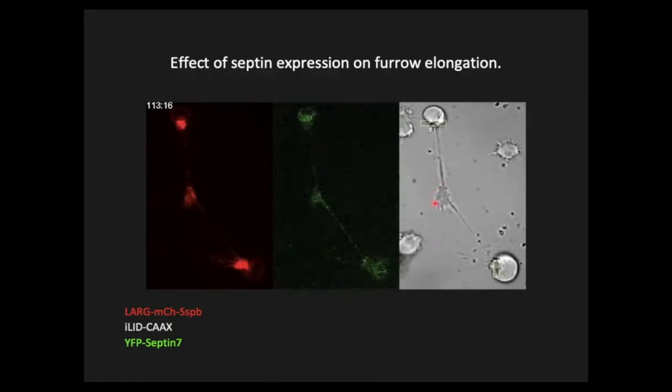You will see, after a while, it seems that in the middle of the intercellular bridge a structure similar to the mid-body starts to appear.